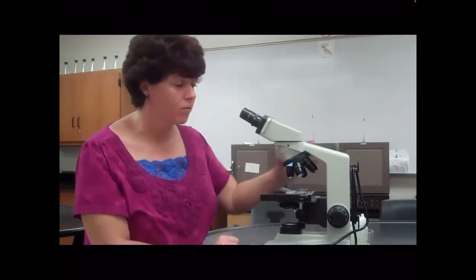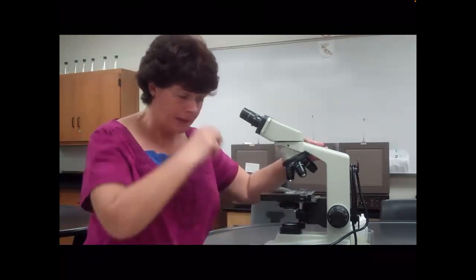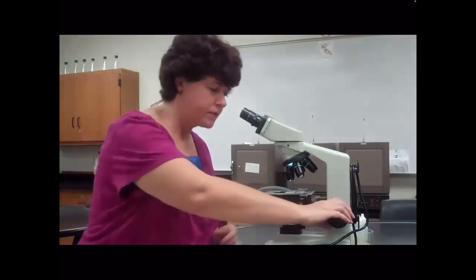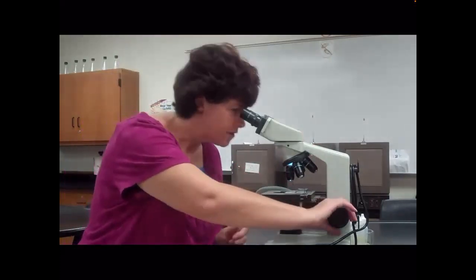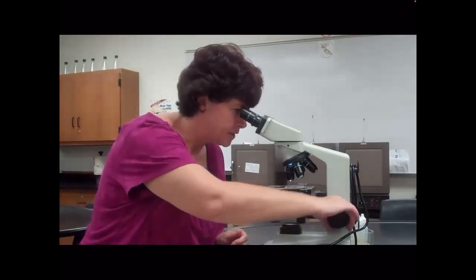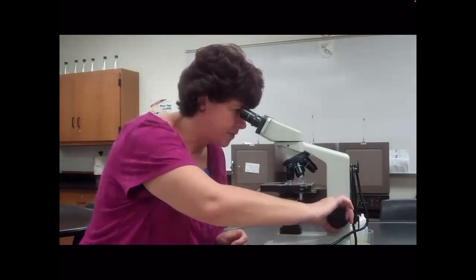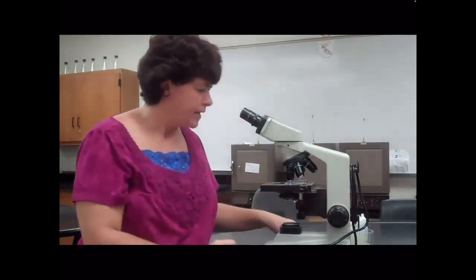Okay? Now we are dealing with bacteria that are very, very small. So we do not need to worry about the 4x power. We're just going to skip that. We're always going to start with the 10. Okay? You will have to find the organism, find the smear with the 10 power before you go any further. Okay? Now, to see if your condenser is in the right place, I have a little trick. So what you do is you find your specimen by using the coarse adjustment knob with the 10 power. So I kind of found it there.